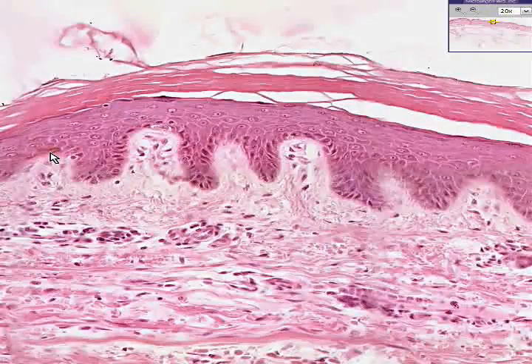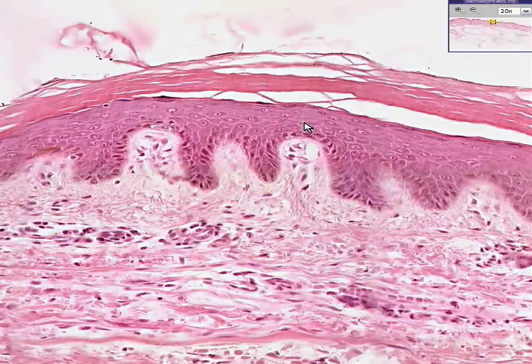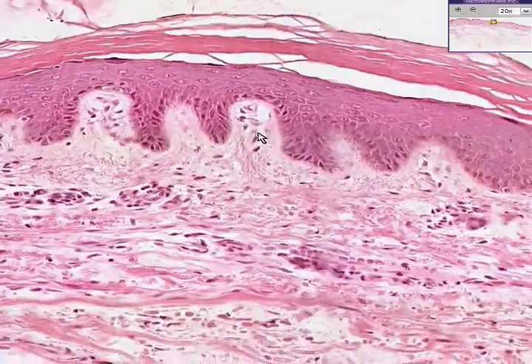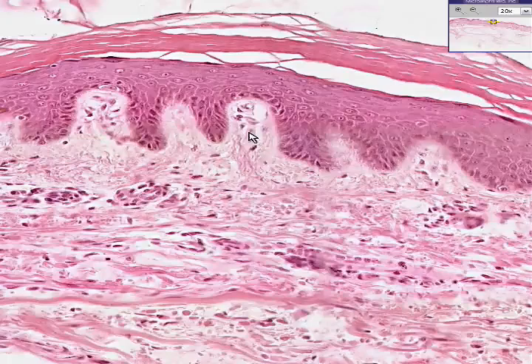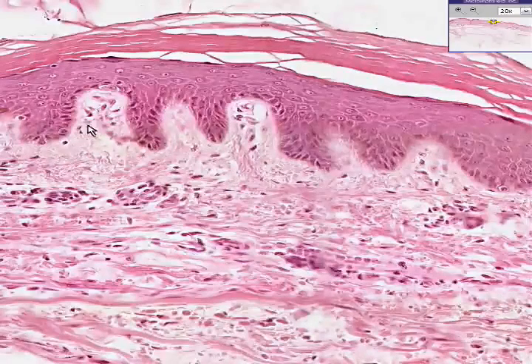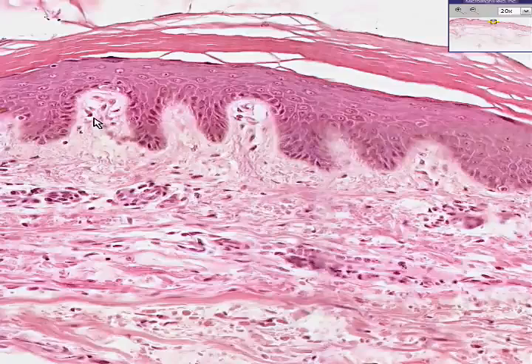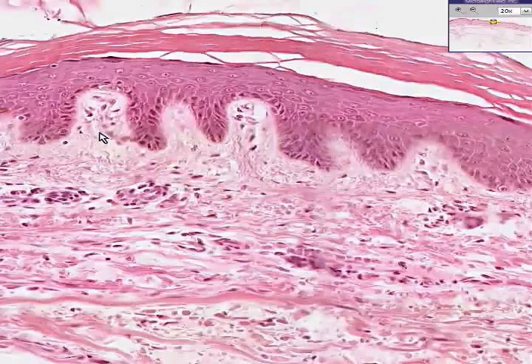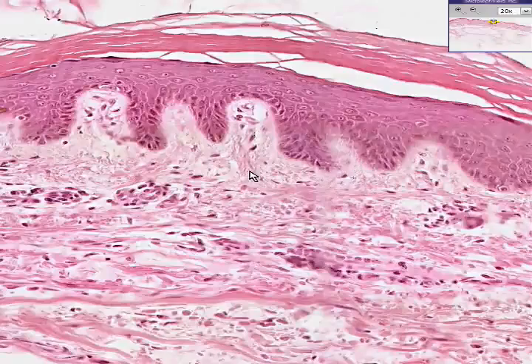Technically, they are not exactly derived from the same area that the rest of these squamous cells or epidermal cells are. Right underneath that, you have looser connective tissue, which interweaves with the sinusoidal fashion of the lower epidermis. This is called the papillary dermis because it has a papillary or finger-like configuration.